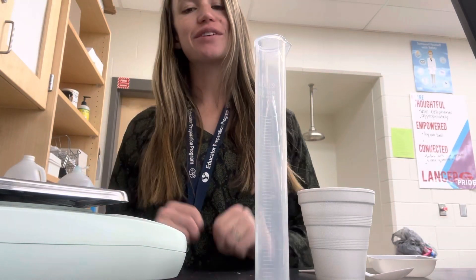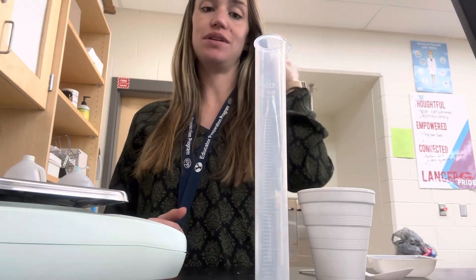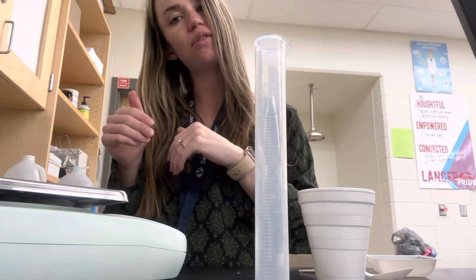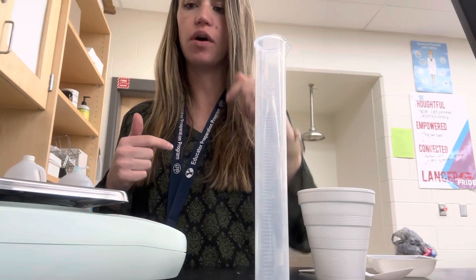Alright, hi guys! Hopefully things are going well with the sub. Today what you're going to be doing is looking at different reactions and trying to decide if they're endothermic or exothermic when they react with water.